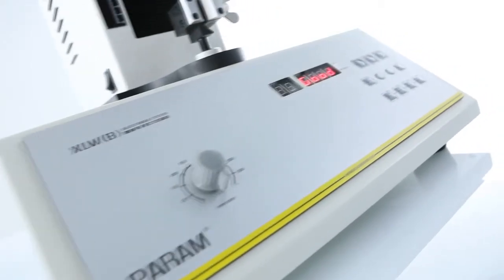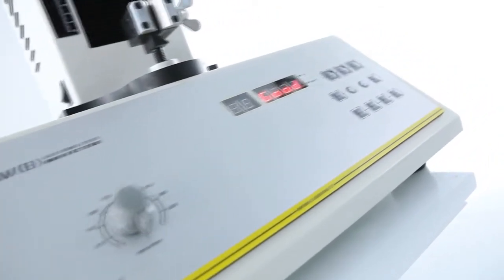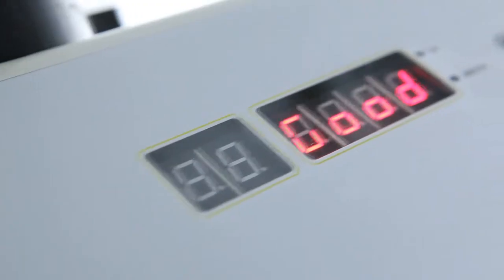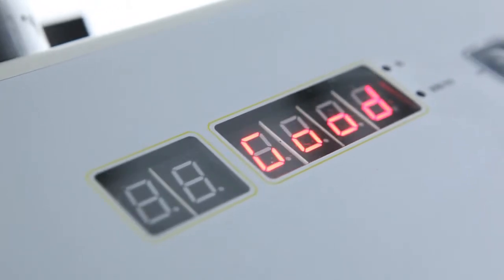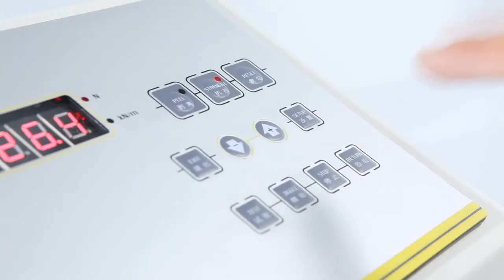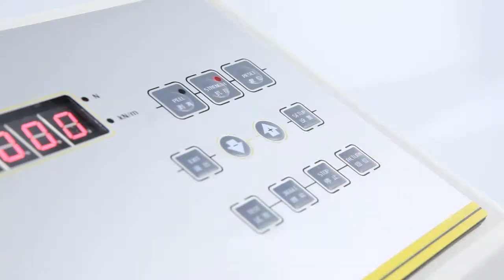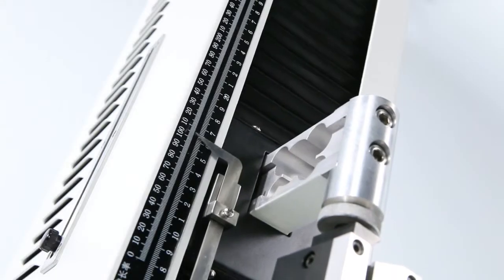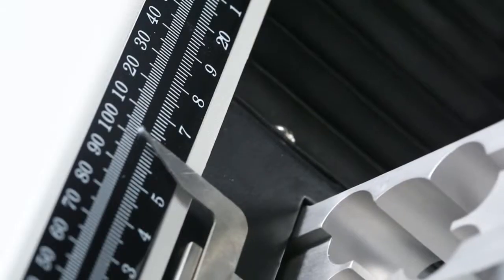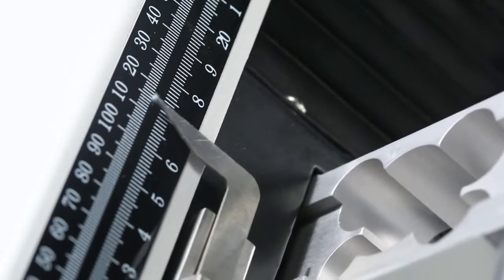The LED digital display and PVC operation panel integrated into the instrument allows users to perform tests without the need of a computer.